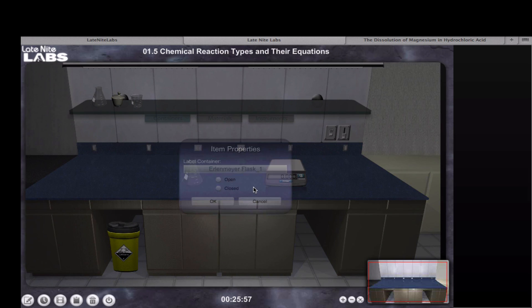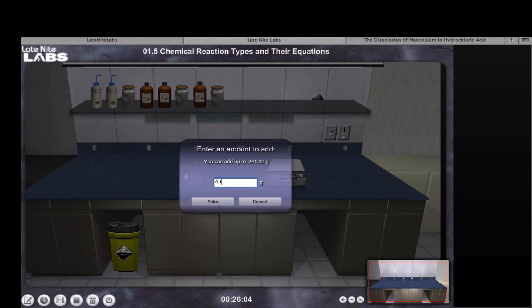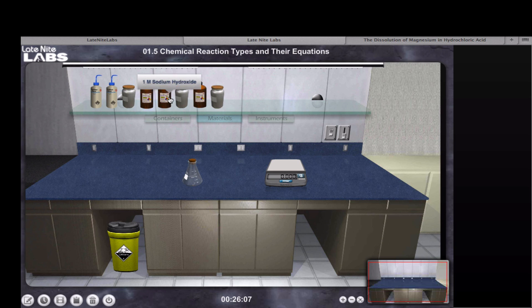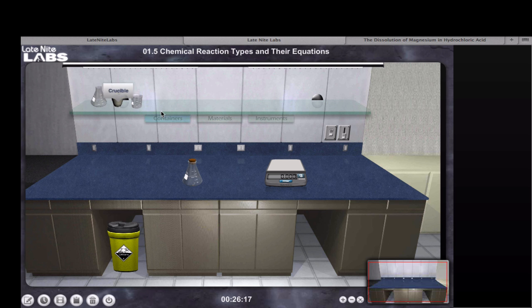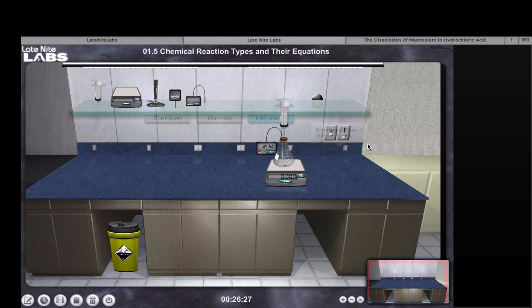I've pulled down an Erlenmeyer flask, and I can double-click on this to close the system. Inside of here, I'm going to place 0.1 grams of magnesium, as well as 6 molar hydrochloric acid. Because the reaction evolves gas and that gas needs volume to expand into, in order to avoid increasing the pressure to dangerous levels, I'm going to put a syringe in the top of the Erlenmeyer flask, and add a thermometer as well, just to monitor the temperature. I'm going to put the whole setup on the balance, so that we can eventually remove the syringe and watch the mass that's lost due to the escaping gas.